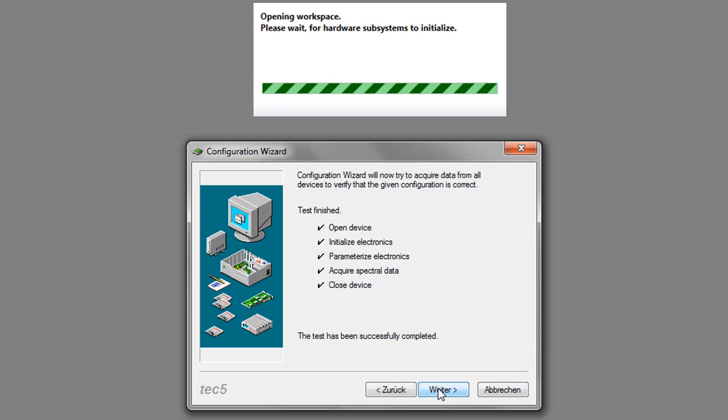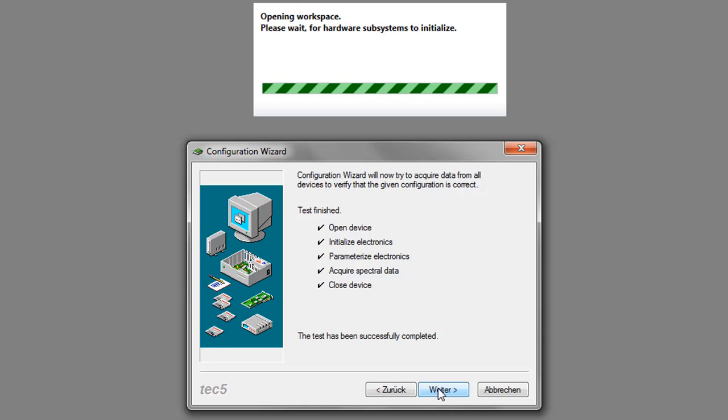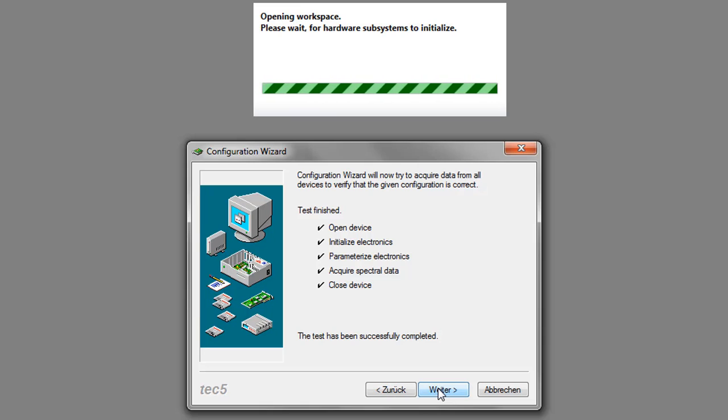After completing the entries, the configuration wizard checks the communication with the spectrometer system and acquires some spectral data.